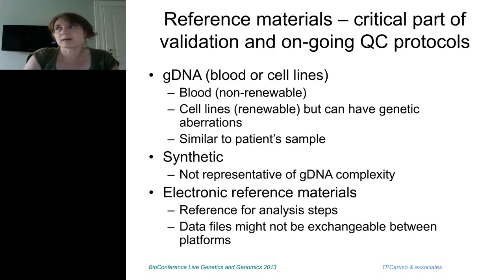And from experience, I would say bad idea, because the DNA will be degraded. You don't know how well your assay is really working. So you should start with well-characterized samples, and I'll show you in a moment where those samples can come from.